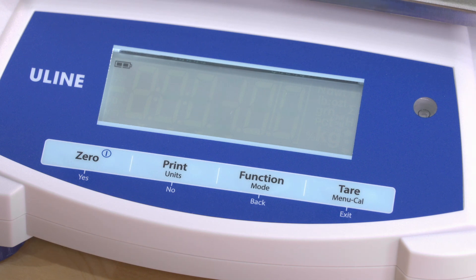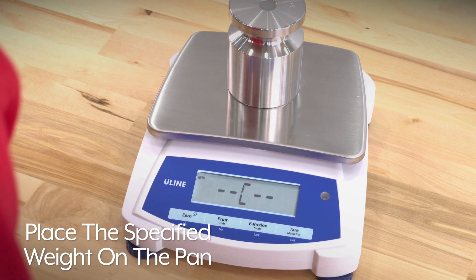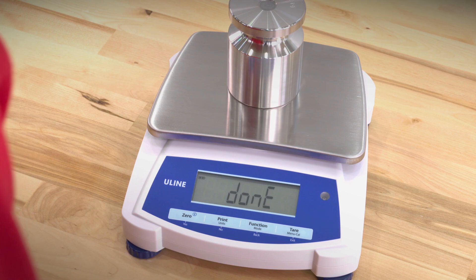The display will show the calibration weight value. Place the specified weight value on the pan. C will blink while the reading is stored.